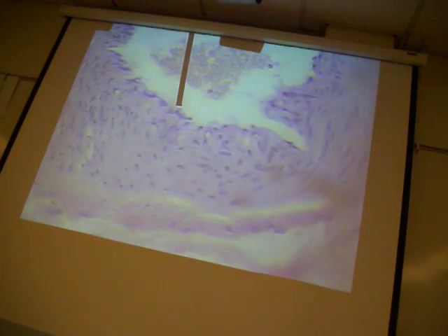The tunica interna. Here's where you're going to find the squamous cells. Now, because we're in a thicker artery, and we're not all the way down in the capillary beds where blood flow is much slower, blood flow is going to be high in the larger vessels, and then as it gets down to your tissue bed, the vessels are going to get thinner. They're going to get smaller in diameter because the pressure isn't as great. Well, we're also going to have a heck of a lot more of them, right? So flow is going to slow down.